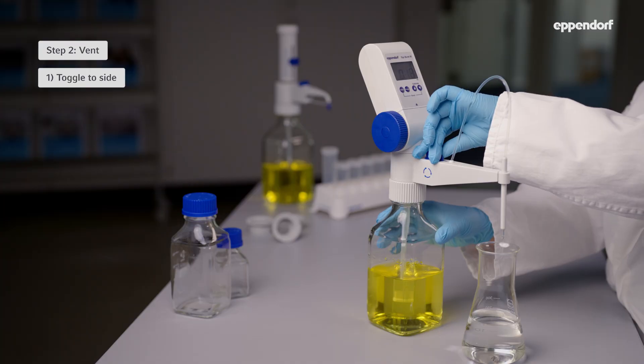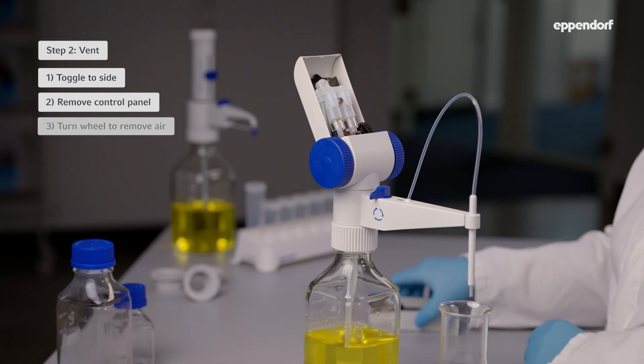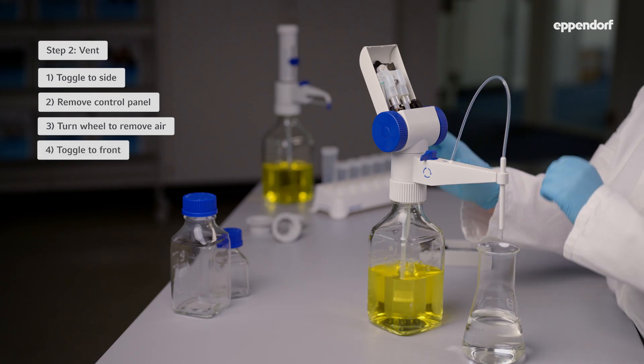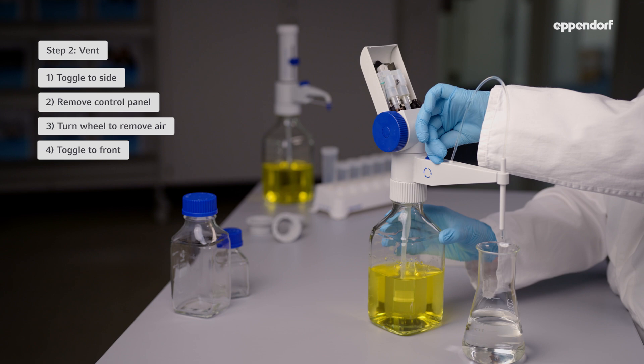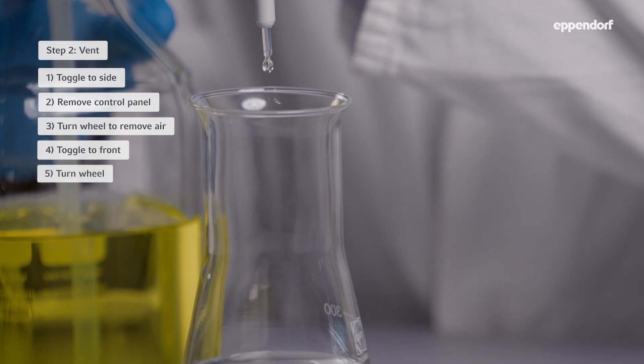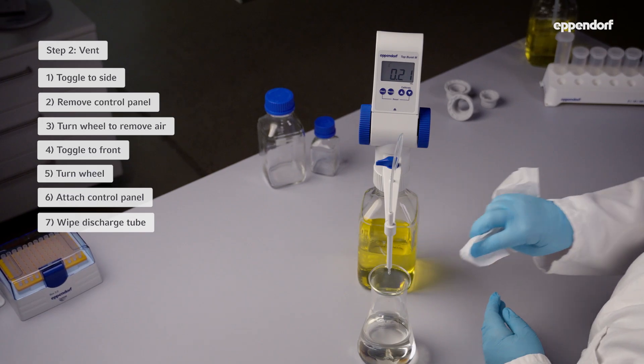Step 2: Vent. Turn the discharge valve toggle to the side and remove the control panel. Now slowly turn the dispensing wheel forward until all the air has left the system. Then turn the discharge valve toggle back to the front and turn the dispensing wheel forward until liquid comes out of the discharge tube into the container. Finally, reattach the control panel and use a lint-free cloth to wipe the discharge tube clean.